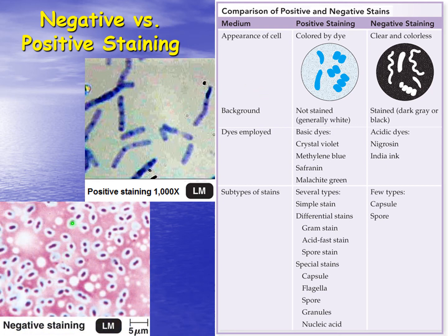Now, we have stained the organisms. That's the organisms right there. But what we did is we stained the slide itself. And so this pinkish color is actually the negative stain. And why we did this is we used a positive stain on the cells and a negative stain on the background so that we could see that halo that's around each one of those microbial cells. And that is actually a structure known as the capsule. And this is a capsular stain.